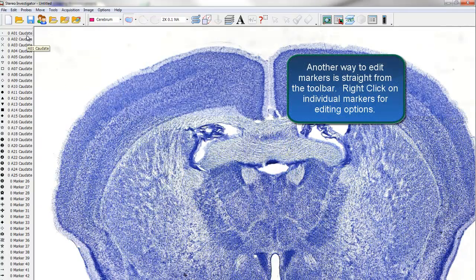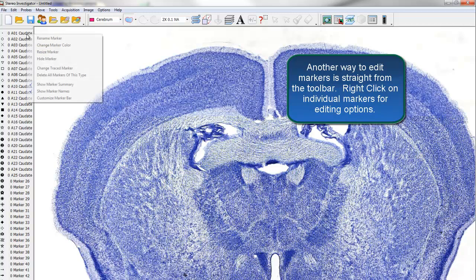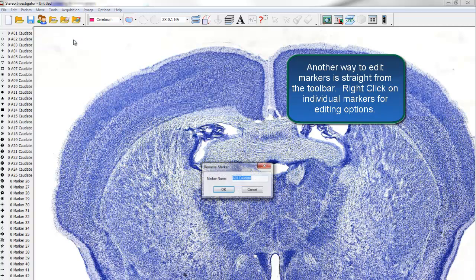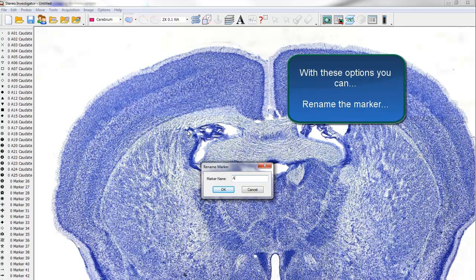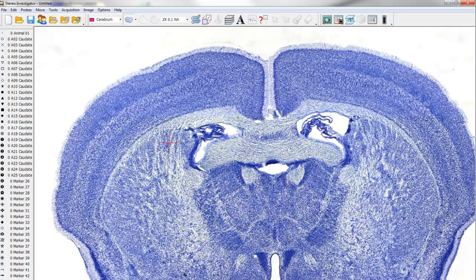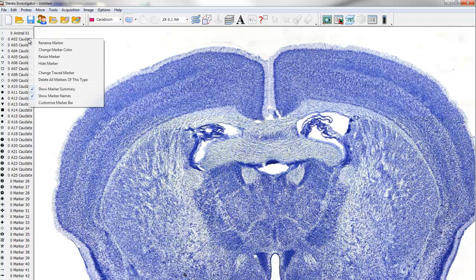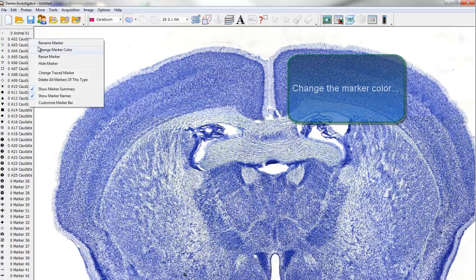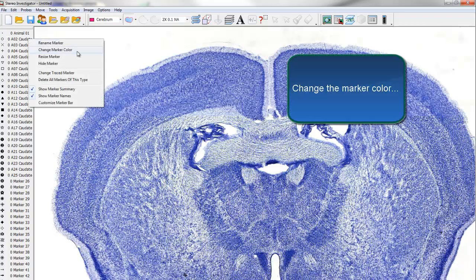Another way to edit markers is straight from the toolbar. Right-click on individual markers for editing options. With these options, you can rename the marker, change the marker color.